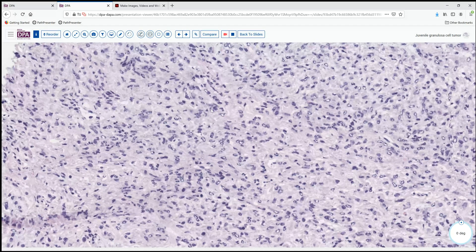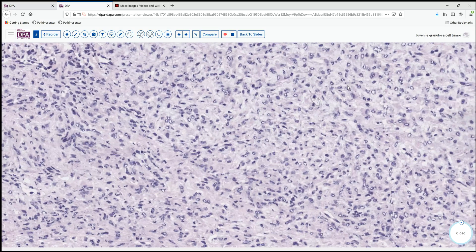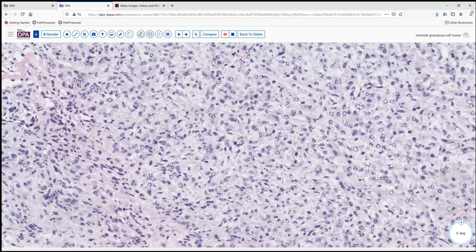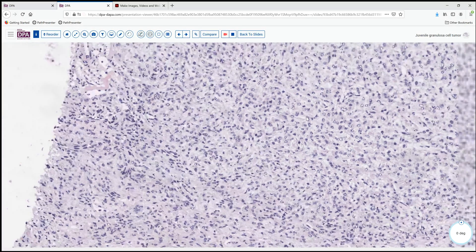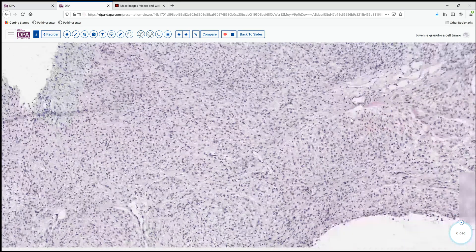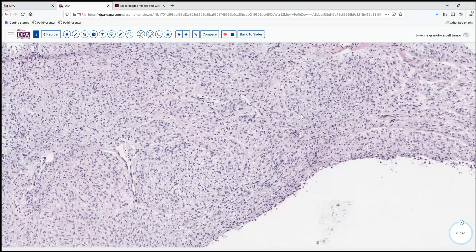There's a lot of cytoplasm here — pale cytoplasm, obviously staining plays into that — and a lot of spacing between these cells. So on frozen section, a diagnosis like sex cord stromal tumor, possibly granulosa cell tumor, or something like that might be rendered on the basis of this diffuse pattern, the follicular structures, and the abundant eosinophilic cytoplasm.